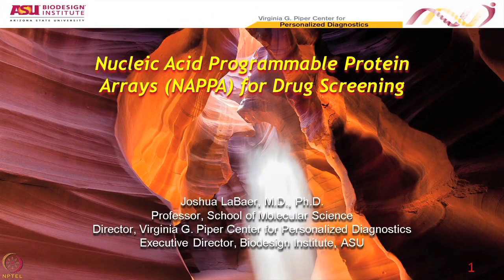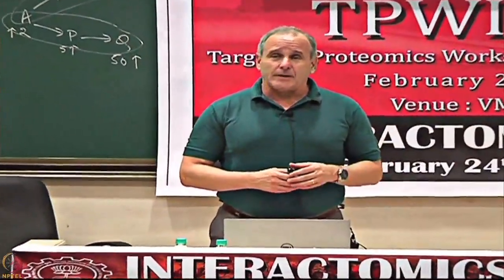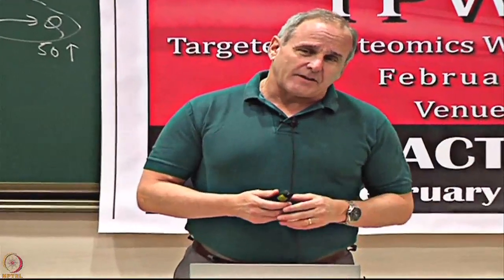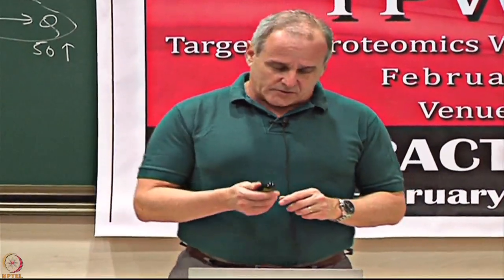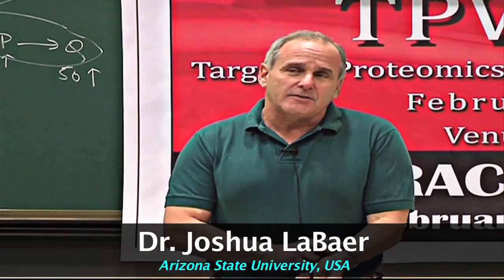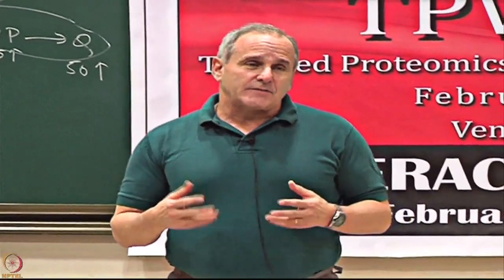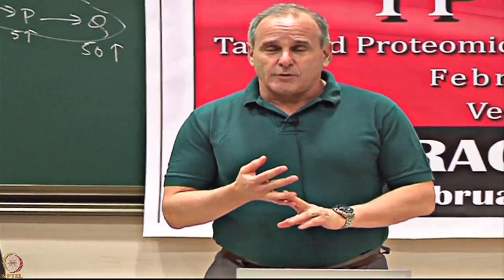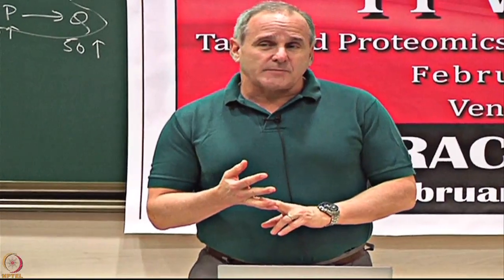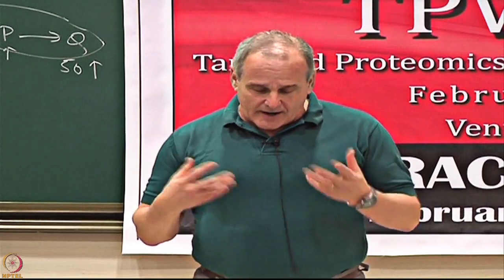Today, since it's the last lecture of the series, let's focus a little bit more on functional studies that we've been doing with the NAPA, with a fairly heavy emphasis on our most recent story. One of the things that I keep saying is that the proteins on the array are active, and I think probably one of the best bits of evidence for that is when we test function of these proteins, protein-protein interaction, enzyme substrate activity, that sort of thing, we usually get it. And so that's kind of how we look at it.